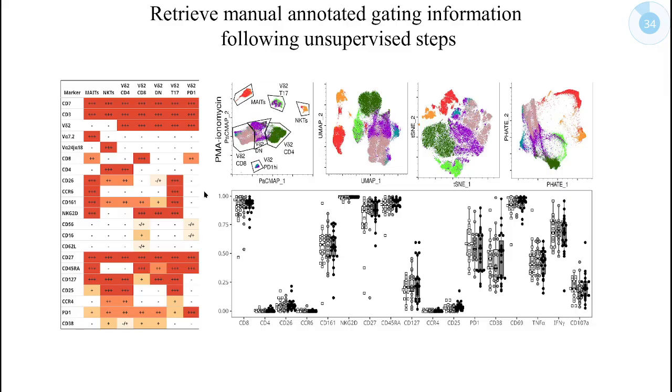But unlike the other kinds of steps as far as that goes, that Core ID column containing the manually annotated gating information is still present. So at that point, it's relatively easy to just gate on a particular island or peninsula of interest within dimensionality visualization, rederive the marker expression on a per individual basis of those cells that ended up within that island, and then get back the same kind of information we can visualize in a heat map table. So it's not entirely just a qualitative assessment, but a little bit closer to a quantitative assessment.